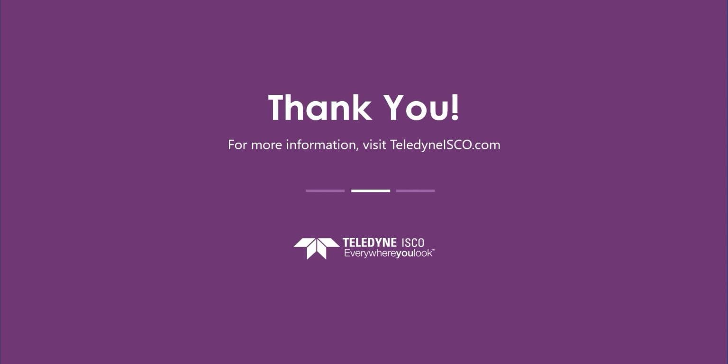Another question is, where can we get some of these PEI columns from? And right now, I believe from Teledyne, we offer a 2EP column, we offer a diol column. I'm trying to think of our other prep columns that we offer. Of course, we're going to offer that silica column as well. I would have to check and get back to you about the PEI column. I'm not sure if we're currently offering that, so I will check on that and I will get back to you on that question.